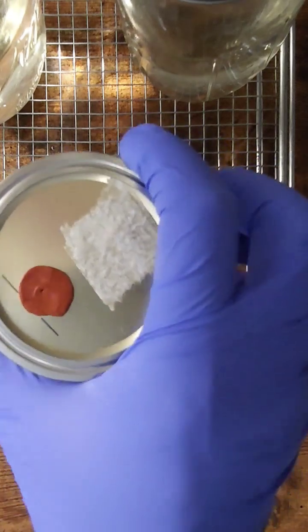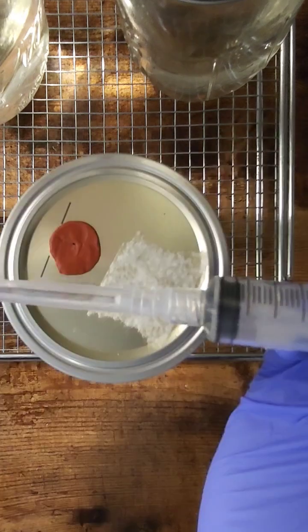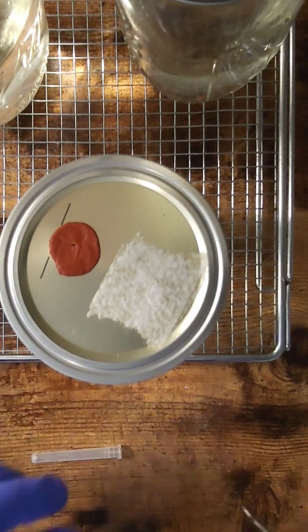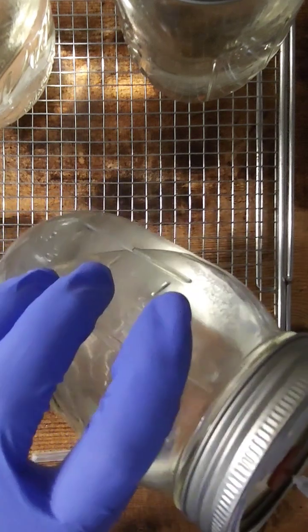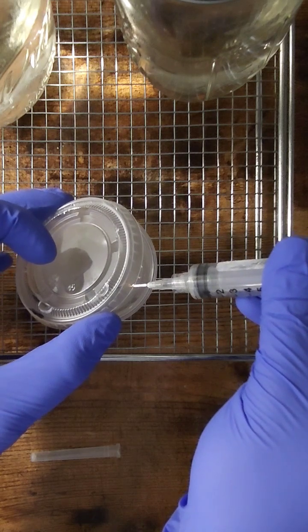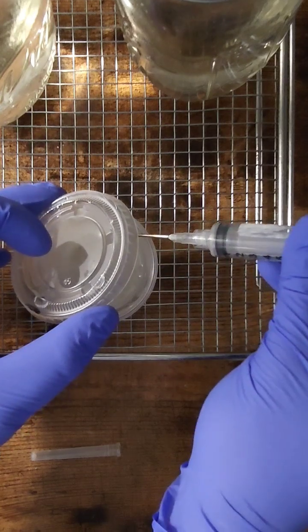We are going to take a look at our potentially contaminated liquid culture, withdraw some fluid, put it to an agar dish, and test for contamination. I'm going to put just a little drop in a few different corners to hopefully observe that potential contamination.